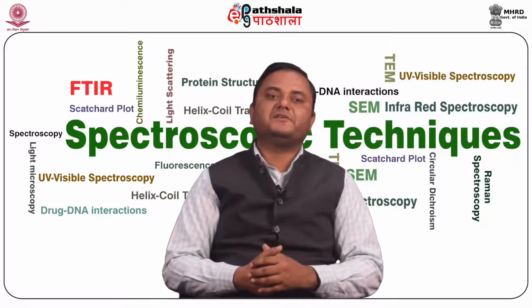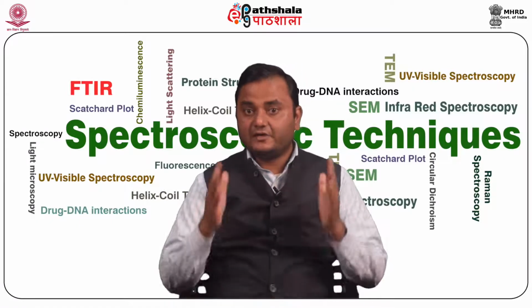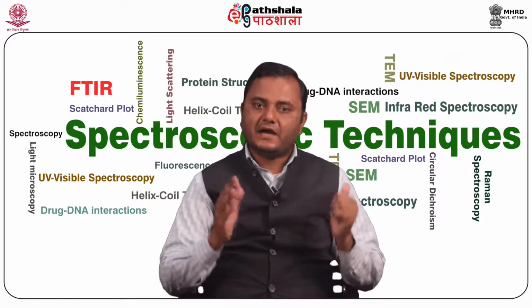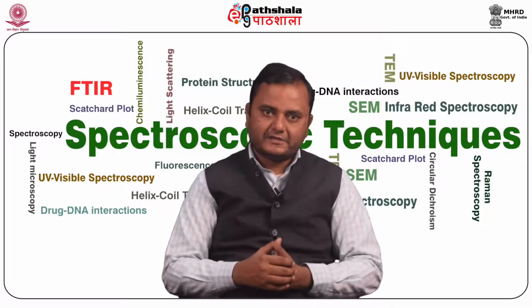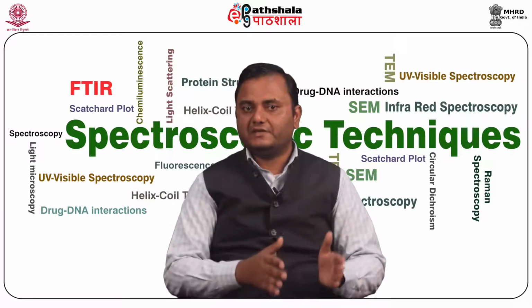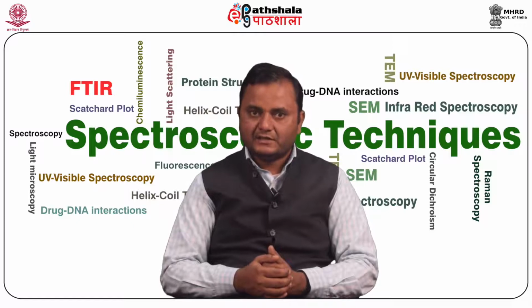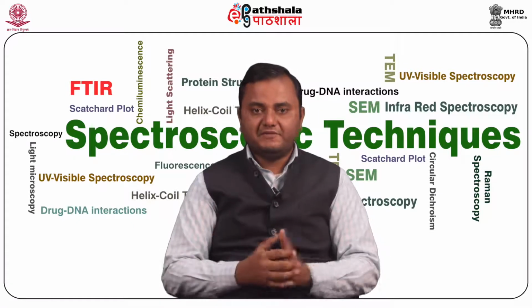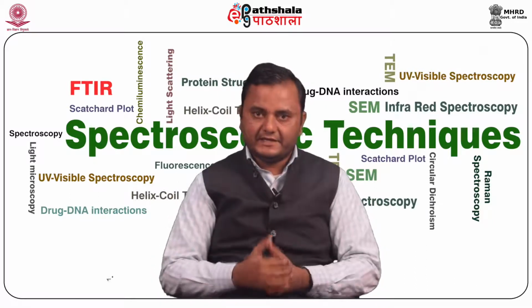The second advantage of FTIR is the Connes advantage. That's the high resolution, reproducibility, and highly accurate frequency determination. This technique allows high speed sampling with the aid of laser light interference fringes. It requires no wave number correction and provides wave number accuracy of 0.01 per centimeter.